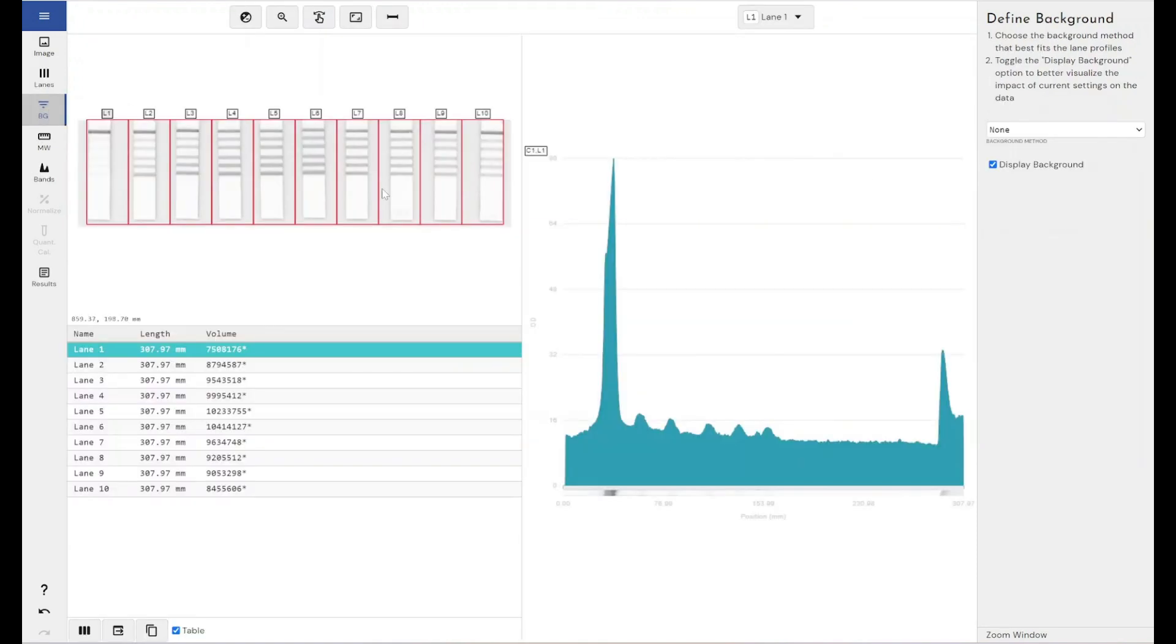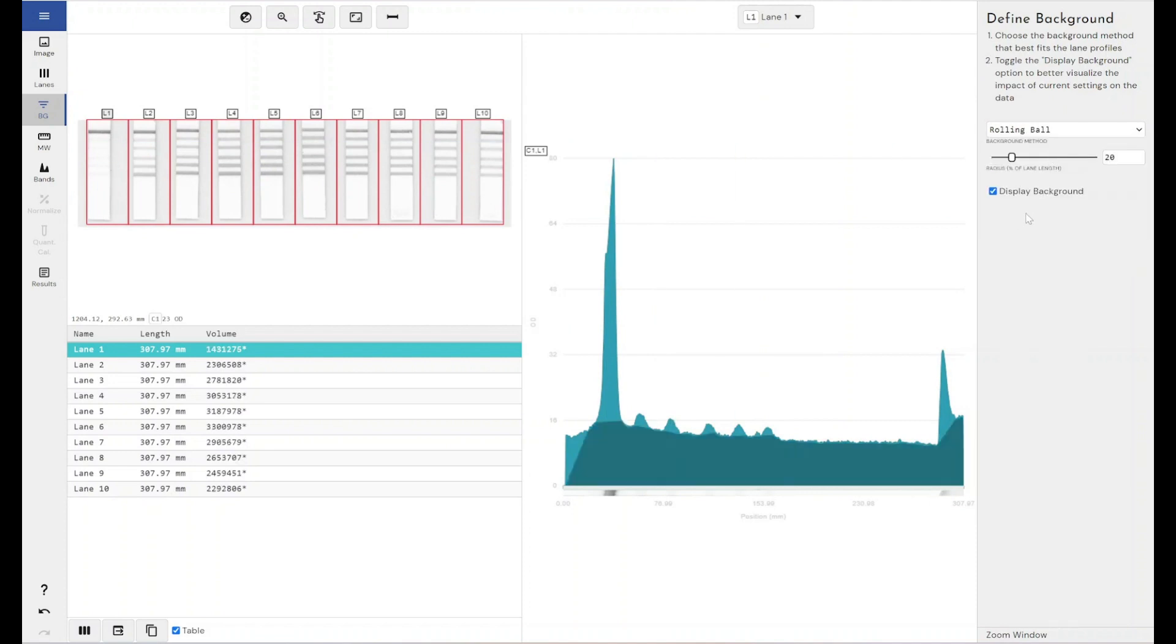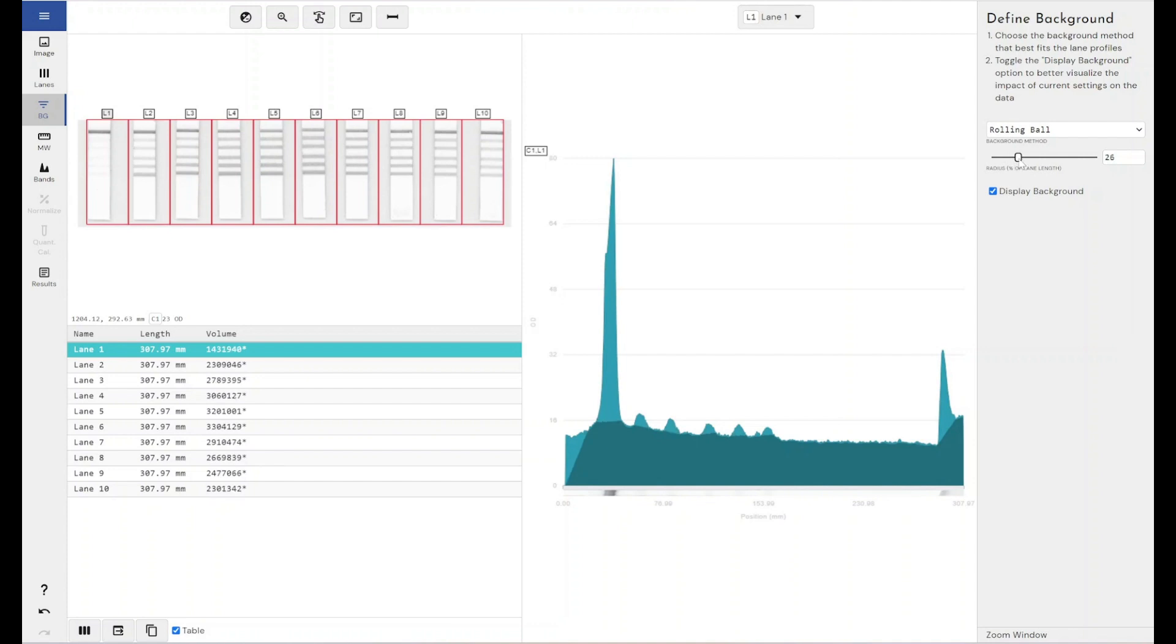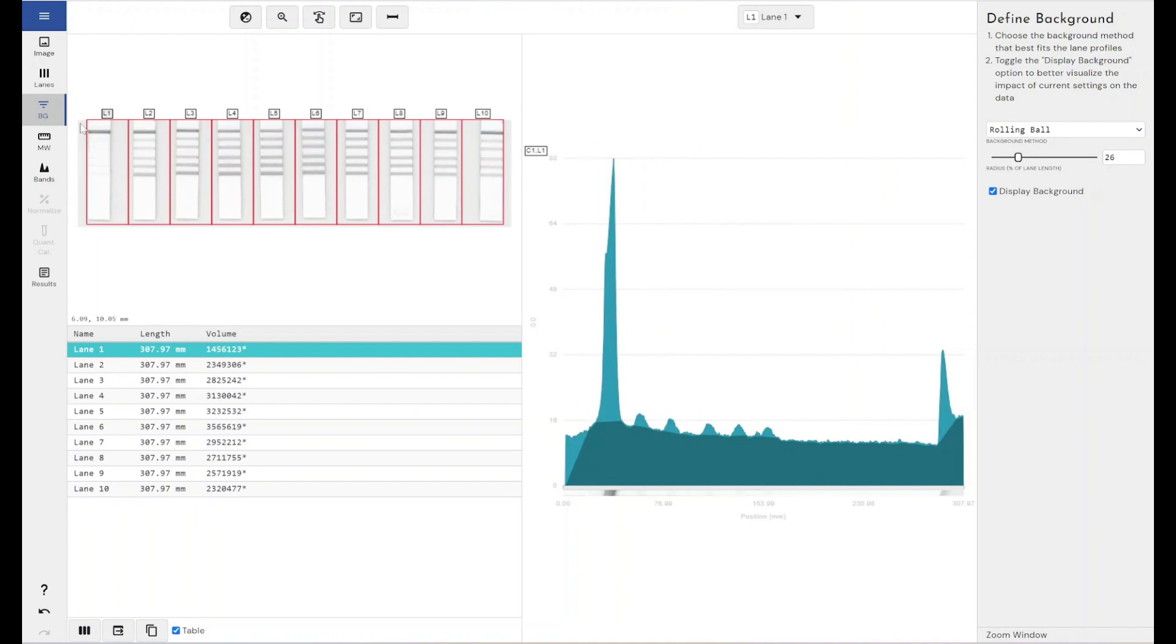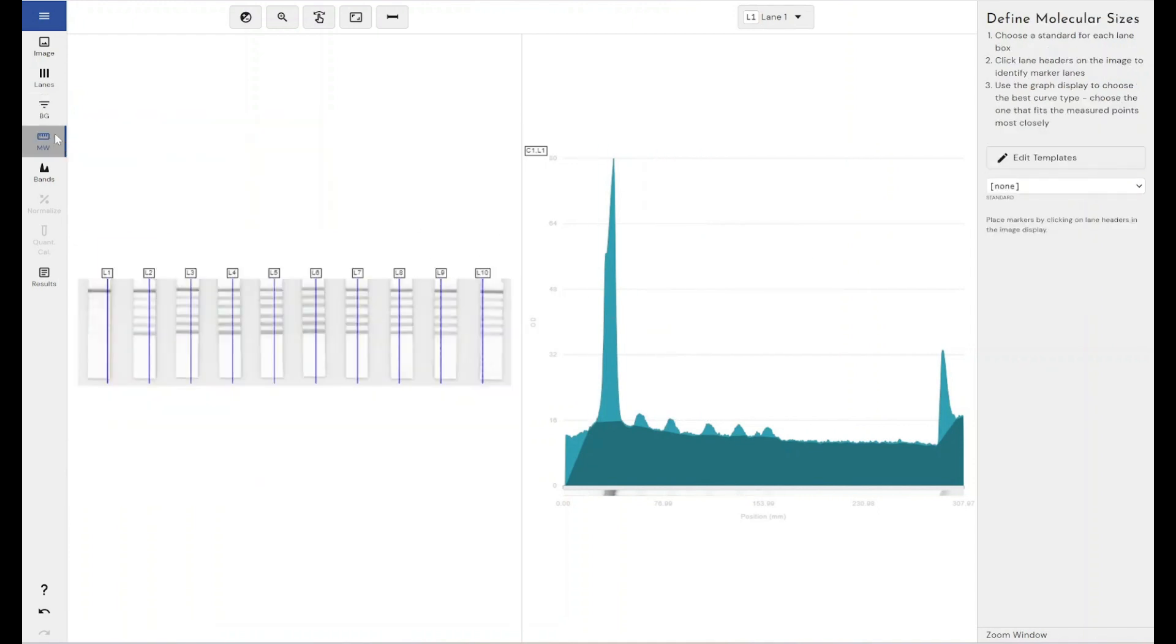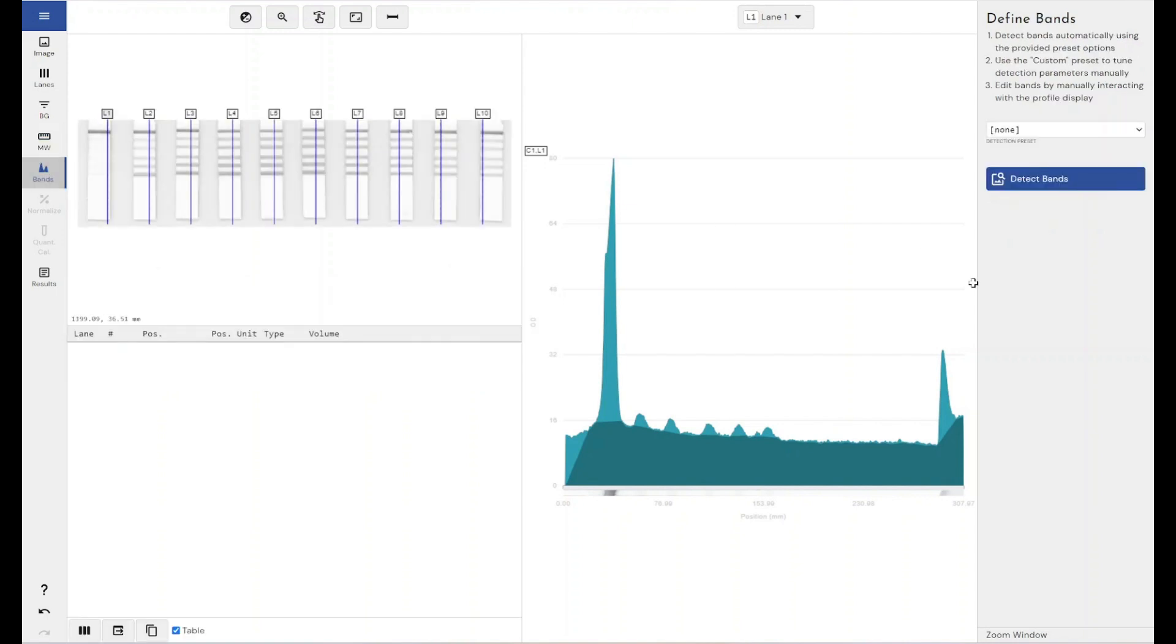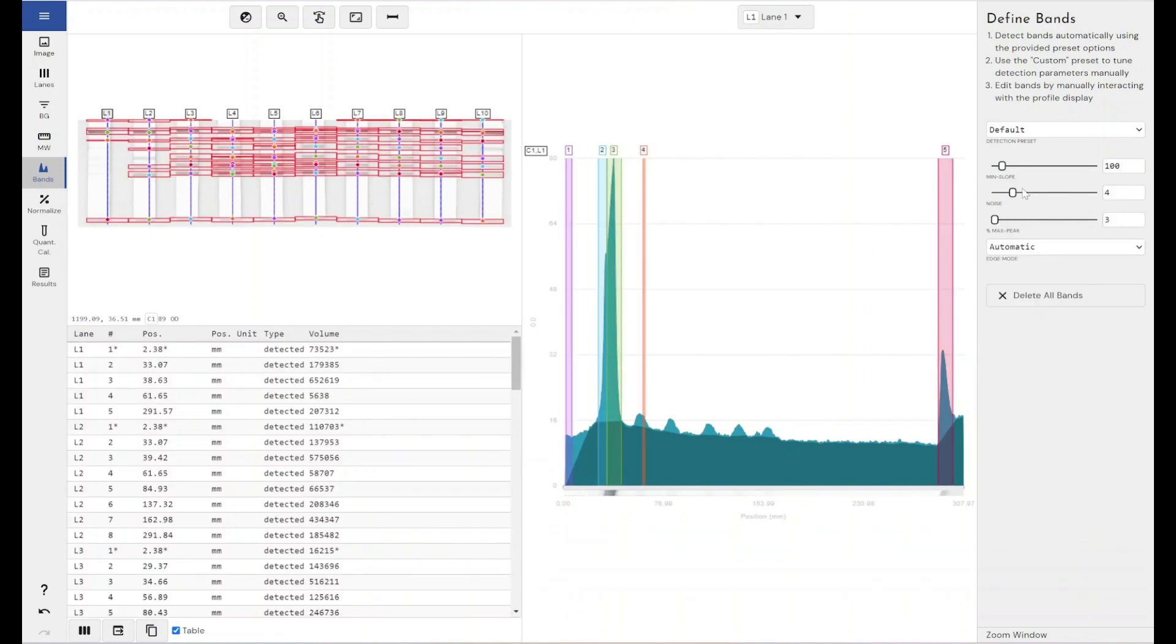I would subtract my background and again, rolling ball is always preferable. There we go, that's a pretty decent setting. Then we'll come through and again, molecular weight is not particularly useful for this experiment because I don't have a molecular weight marker standard to line this up with.